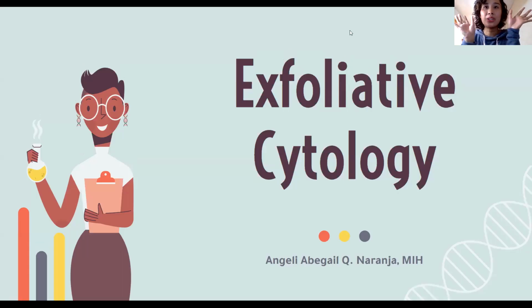Hello guys, so andito na tayo sa exfoliative cytology. So this portion now of our histopathology focuses on how we handle the smears that come into our laboratory.